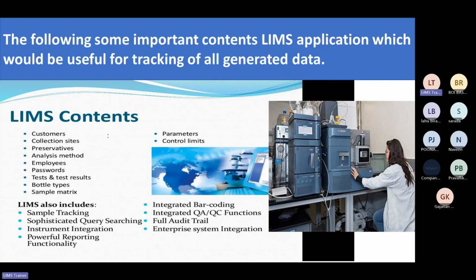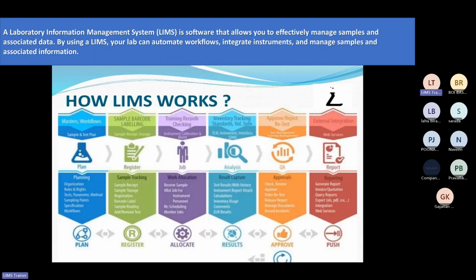Then the workflow, how the workflow actually happens in the software. The first thing is the plan. The planning of that particular analysis will happen. After this, the registration of the sample. The sample is required to be registered into the software.